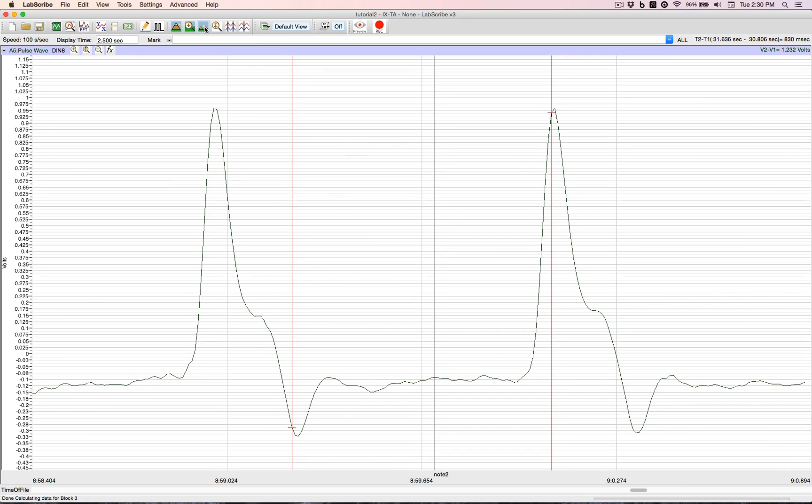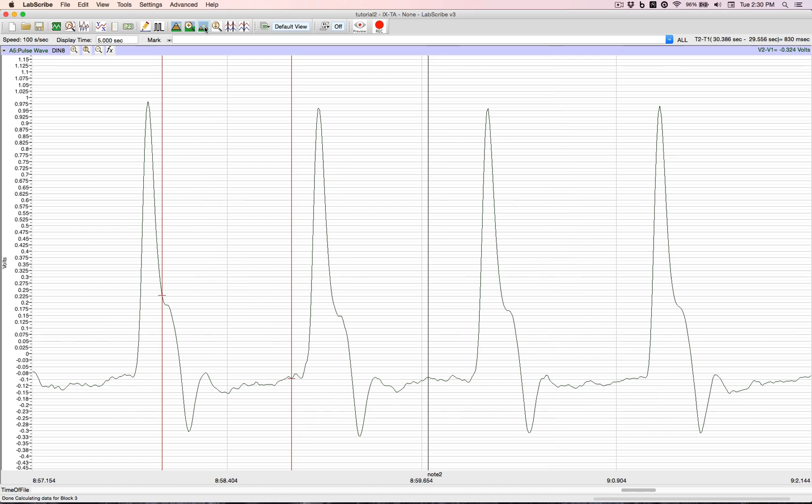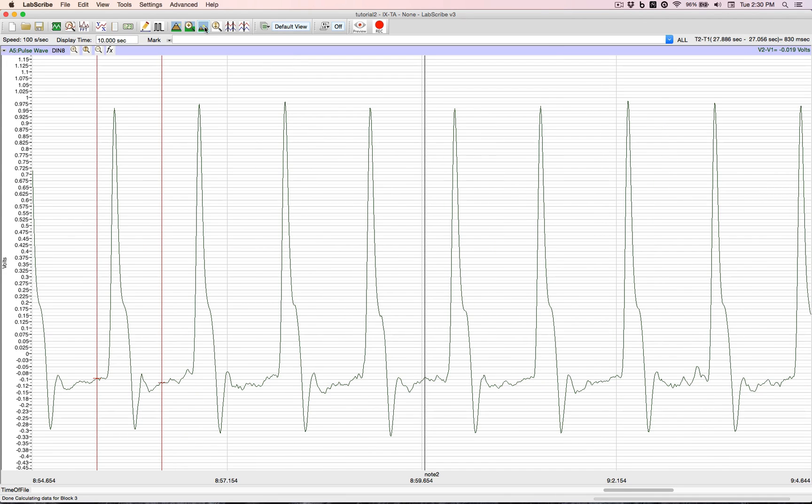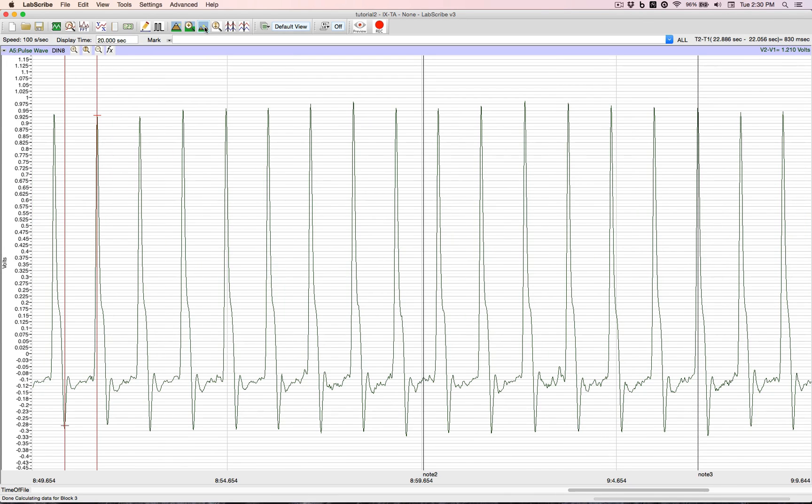Going in the opposite direction, we can double our display time back to 5, back to 10. Now we can go to 20 and even 40.